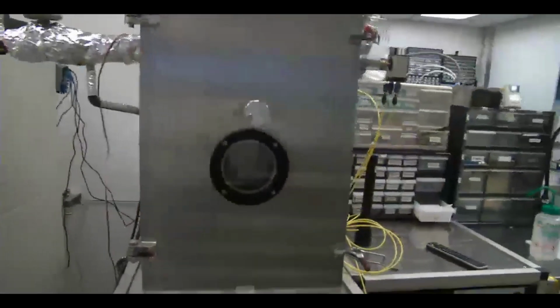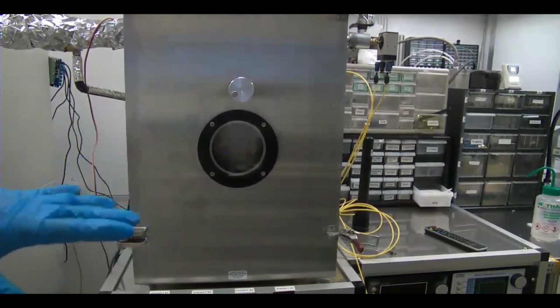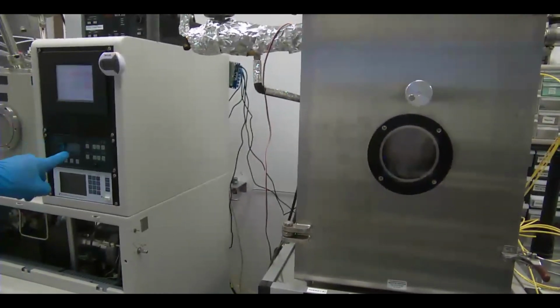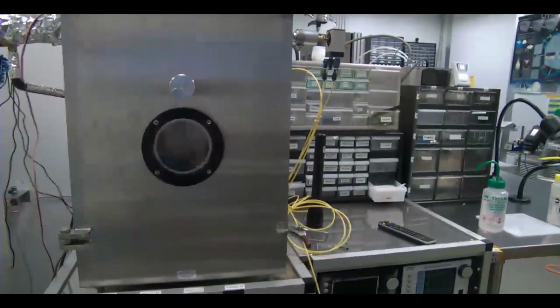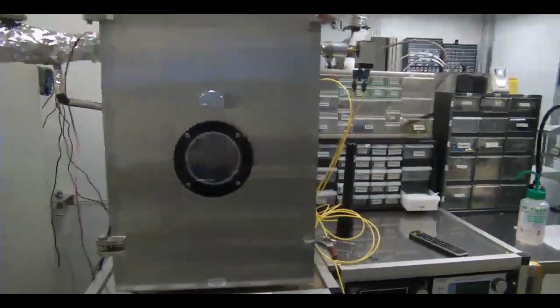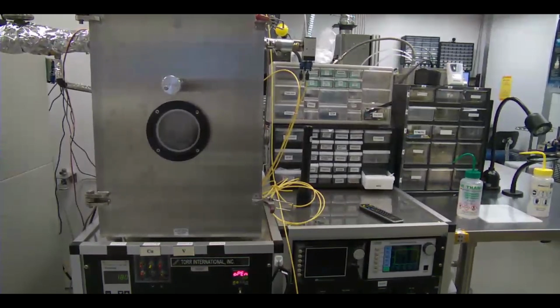So this is another vacuum chamber where we do evaporation of materials. Both of these are classes of deposition: physical vapor deposition. Sputter deposition is a cold deposition, no heating required, even though there's collateral heating. This is a hot deposition where material is heated and we rely on the vapor pressure of the material to cause deposition. So here we are using pellets, there's no cathode, there is no target. We are using a pellet and heating up those pellets.